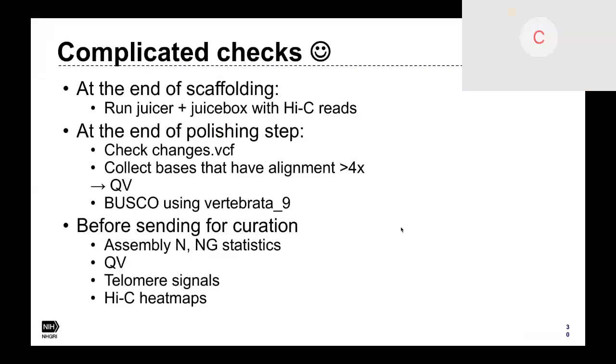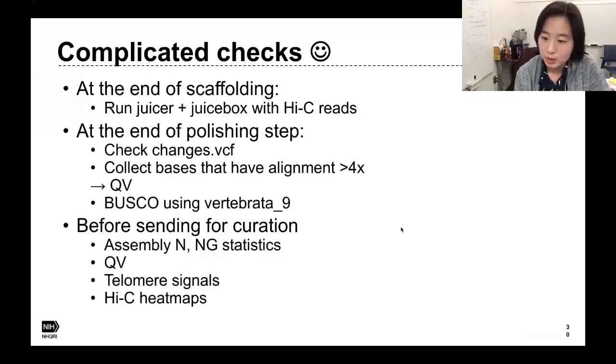And because the PacBio reads are relatively short versus the other platforms that we use for scaffolding, we don't expect that the PacBio reads will cover most of the gaps and fill them in properly, because the ends are already kind of ambiguous from the PacBio reads' point of view. It was broken by Falcon already because there was some ambiguity to go along. Okay, thank you.